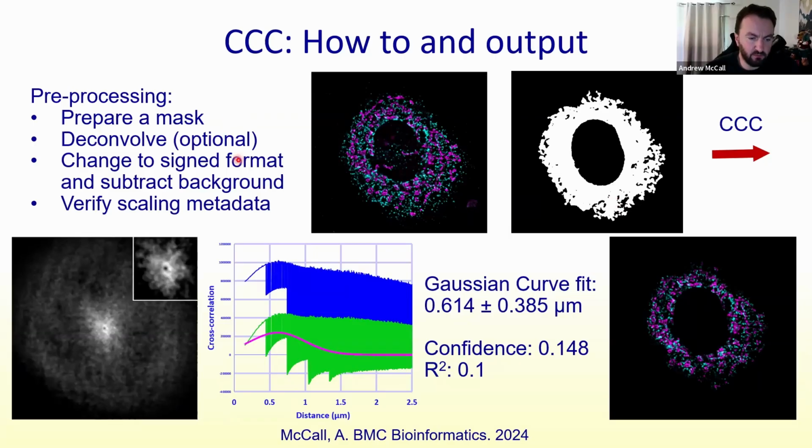You're also probably going to want to deconvolve your data. If you're not familiar with deconvolution, I sadly don't have time to discuss it in detail, but basically it's a form of mathematical deblurring. It's relatively accurate and definitely a good idea. You will get better results when you deconvolve your data.